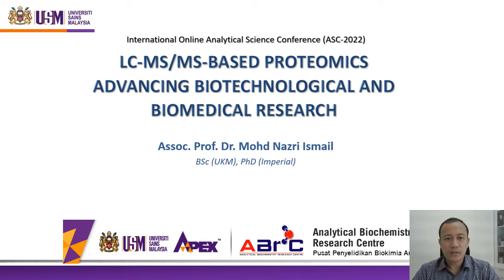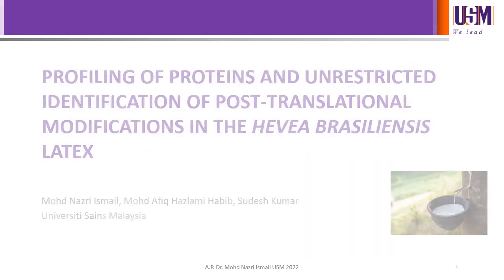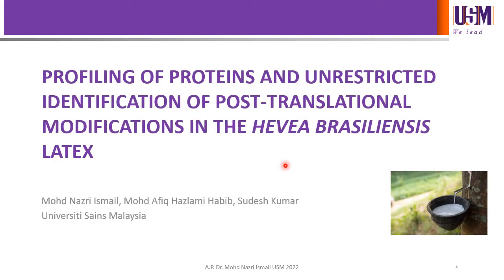The title of my talk is LC-MS/MS-based proteomics, advancing biotechnological and biomedical research. Today I will talk on two main projects. One is related to the biotechnology of rubber latex, and the other one is related to the biomedical aspects of diabetes. On the first project, it is on the profiling of proteins and unrestricted identification of post-translational modifications in the Hevea brasiliensis latex.